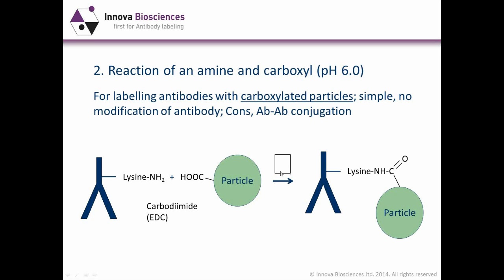There are some fairly complicated reactions here and intermediates. You really don't need to worry about that. All you want is your conjugate, and it just pops out at the end. The particle has effectively become attached to the lysine group. Again, really simple chemistry. Don't need to complicate it with lots of functional groups you've never heard of before.